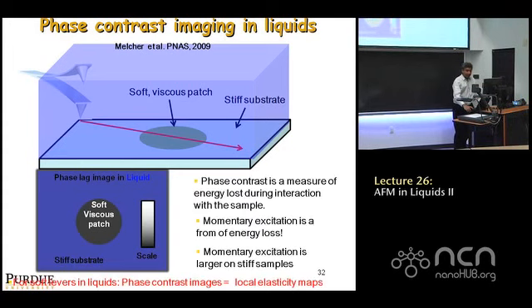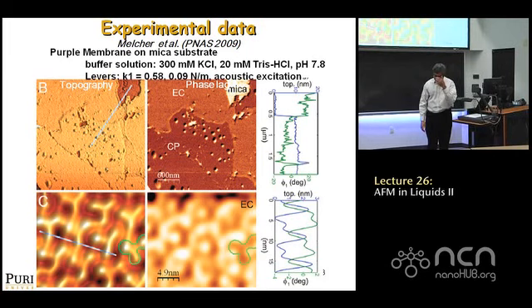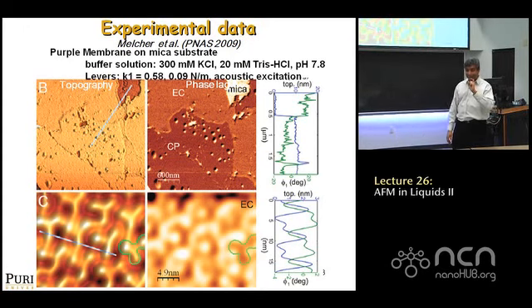All right, so of course, needless to say, when we go back to most images taken on purple membrane or DNA or viruses, make sure you're careful about plotting phase lag and not just some random phase. Be sure to calibrate your system to figure out if your system plots phase lead or phase lag. We've discussed how to tell if your system plots phase lead or phase lag.